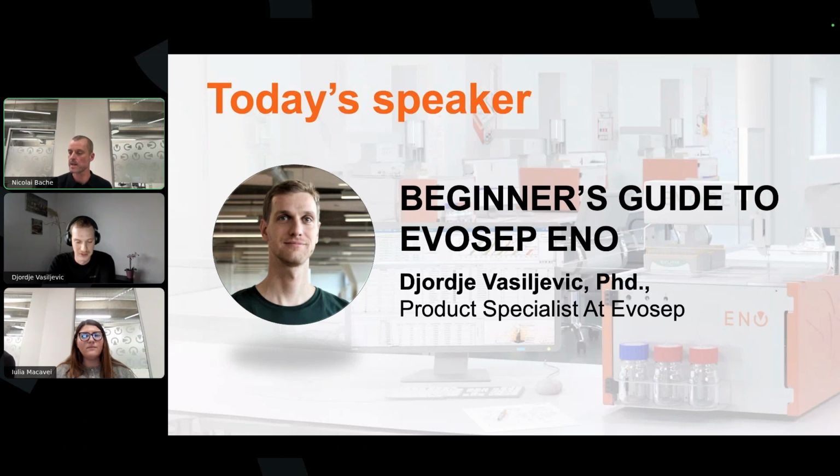Yes. Any comments from you, Djordje? My only comment would be for our column: I always suggest to customers, when you store it for a longer time, put it back in the original box, because then it can be closed and protected from dust. Some labs are clean, but some labs are very dusty, and if there is a dust particle sitting on the connector, then you squeeze it in, and it can create problems. But apart from that, they are absolutely fine sitting dry in the box in the drawer for a long time. And as you said, afterwards, just run one or two HeLa samples to equilibrate it, and it's good to go again.